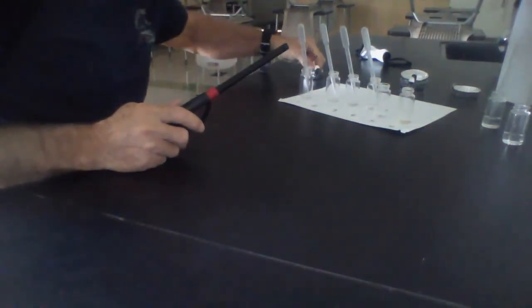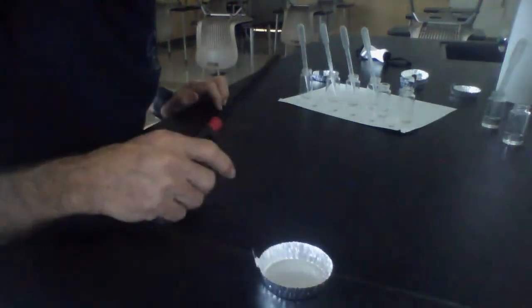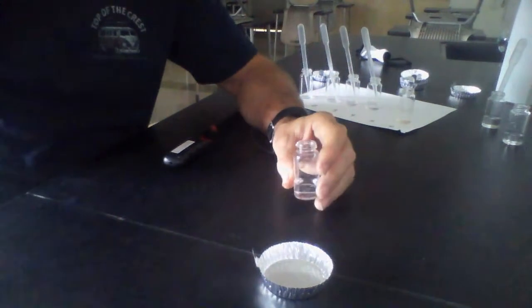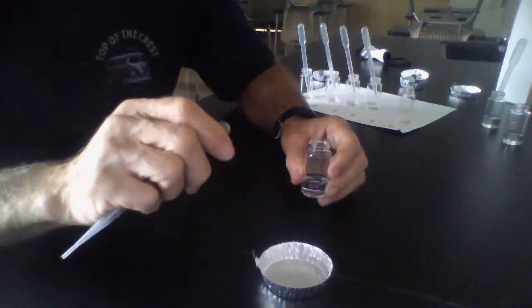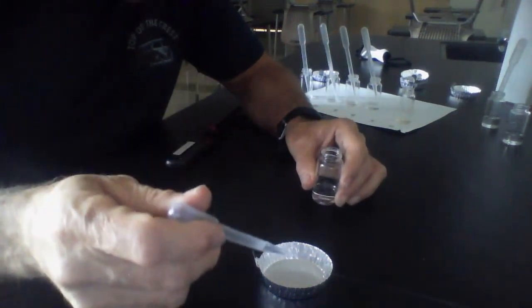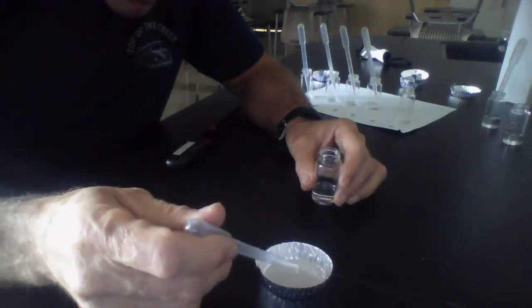Big, if you want to watch one of these, you can. I am recording, but yeah, go ahead, keep recording. Did I lose track of what? I must be on number 5. So we're going to burn number 5. We're identifying the alcohols, and I'm recording it. So I got 5 drops. 1, 2, 3, 4, 5.